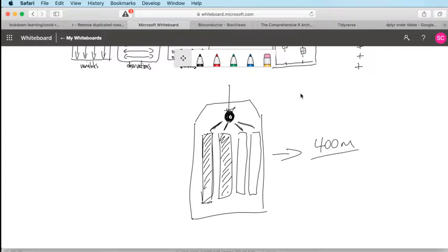You're not just going to divide your 400 million reads by 20 and each gets 20 million reads. That isn't the way that works. It's to do with the molarity in the library mixture that you load.